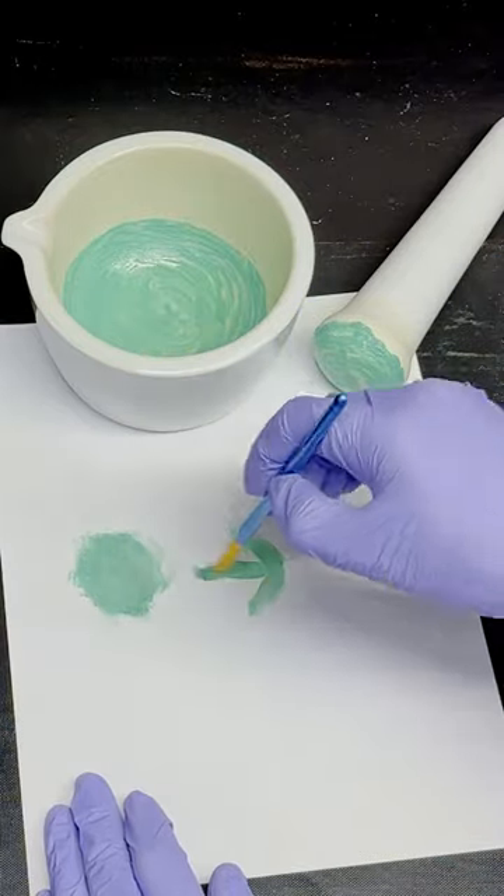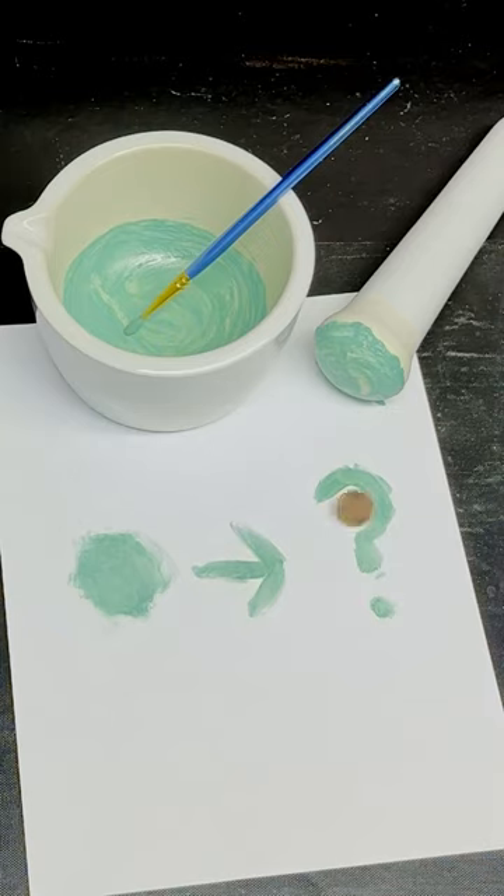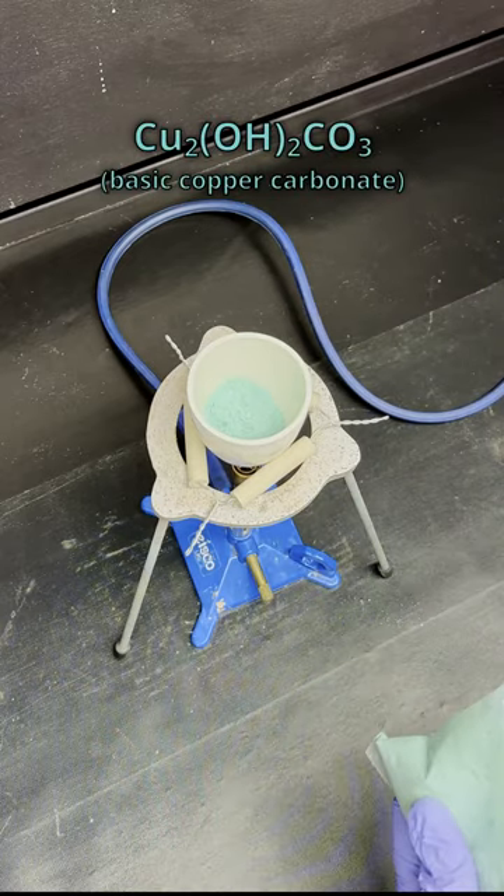This is a paint called verdater, but have you ever wondered what gives paints their color? In this case, it's copper, and I can prove it. This pigment is known to chemists as the salt basic copper carbonate.